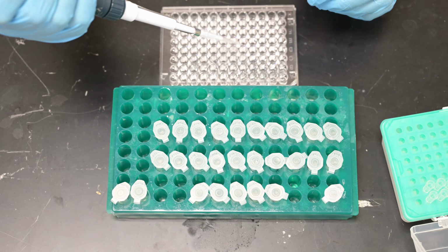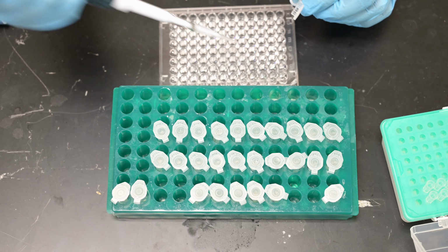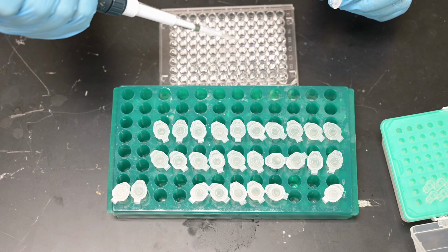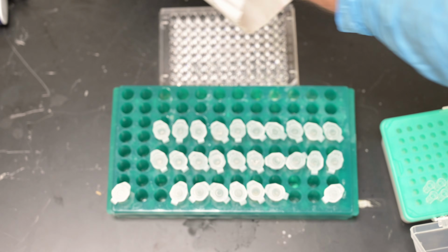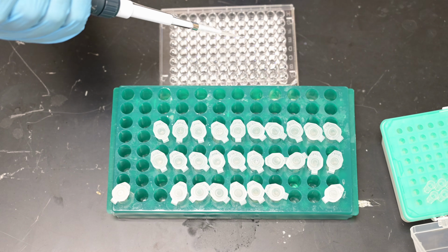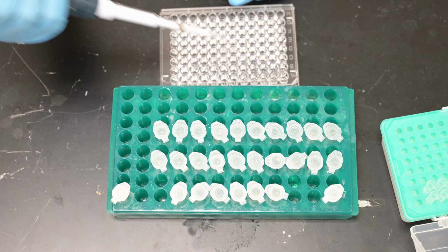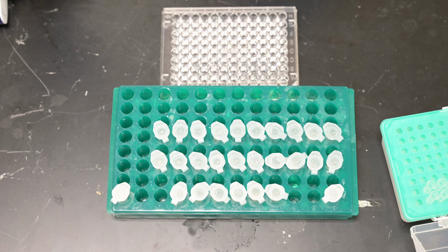Right, just check and make sure. This is the 5th sample, goes into D5 and E5, D6, E6.